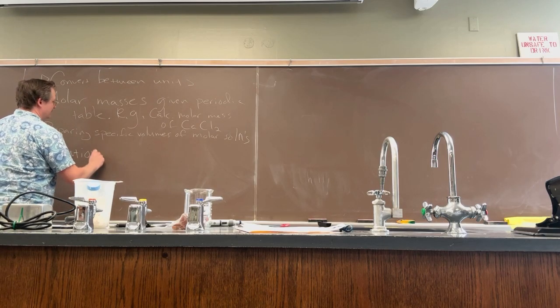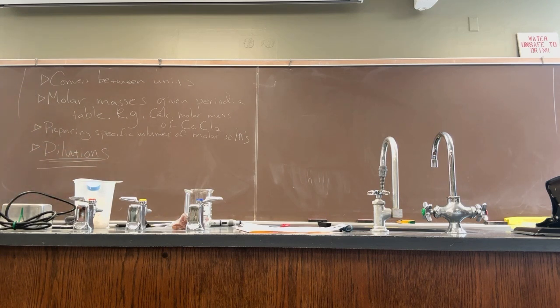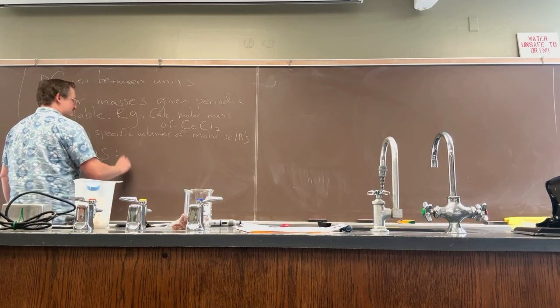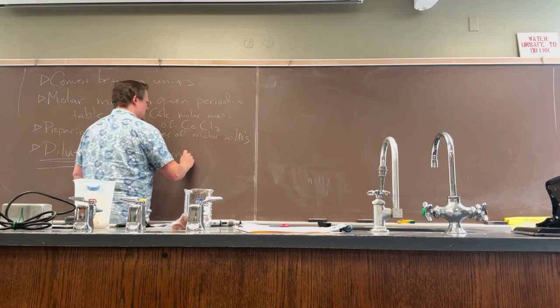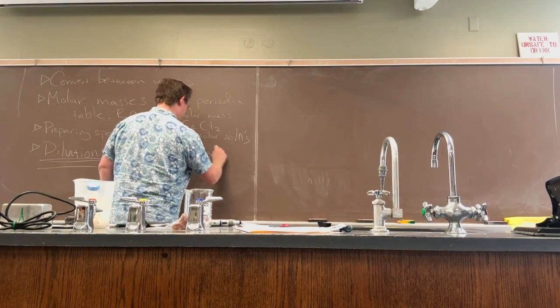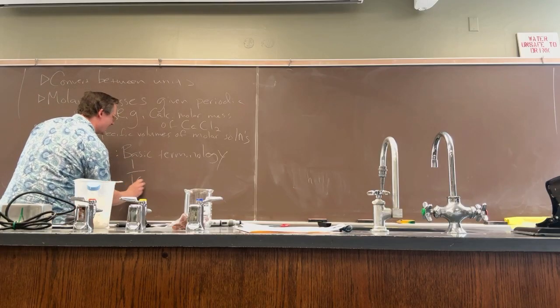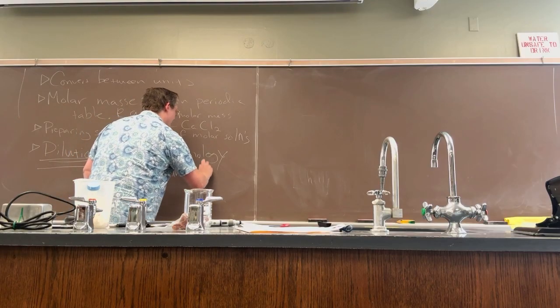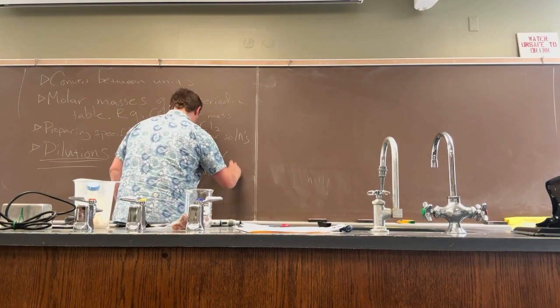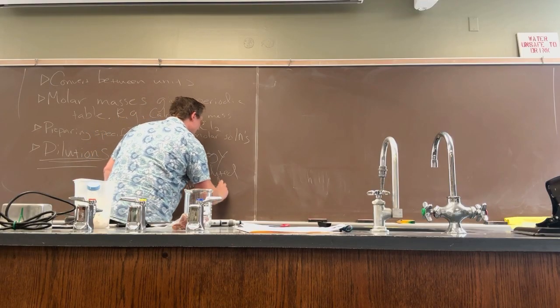Dilutions. Dilutions, dilutions, dilutions. Basic terminology, like 1/10 equals 1 unit undiluted plus 9 units diluent.